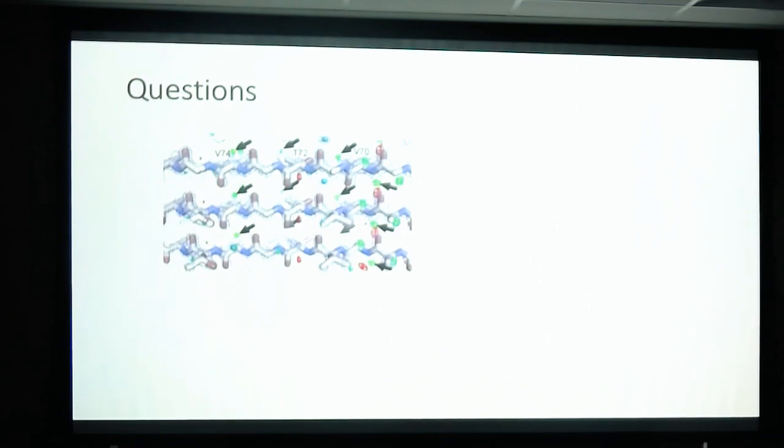Certainly there have been huge improvements on that end too, and collecting synchrotron data is much more automated. Sometimes the strategy is to try to make the crystals a little larger somehow, but this has been proven to be a viable technique.